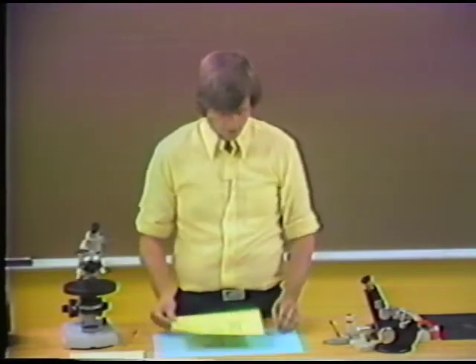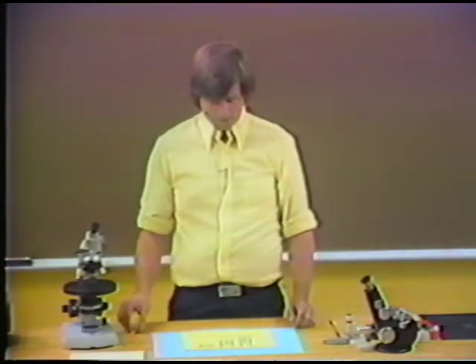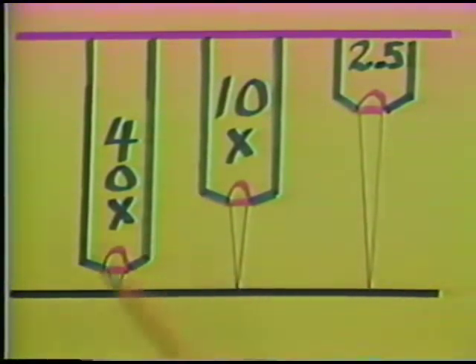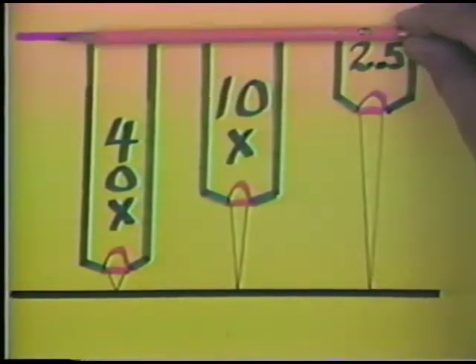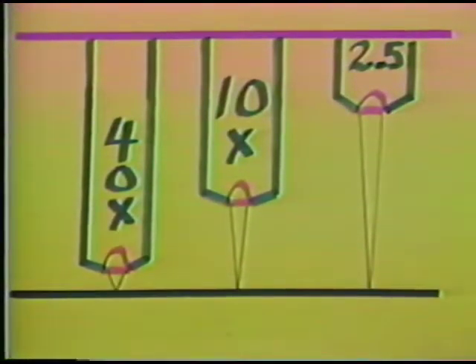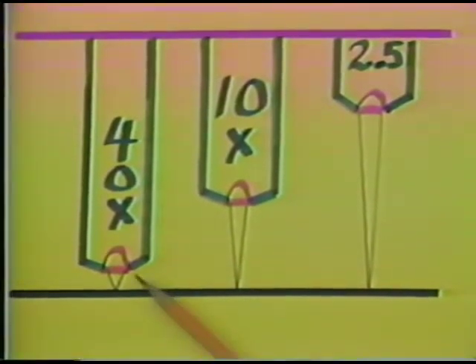Now, this next graphic shows the relationship between the magnification that is typical and the angular aperture and the free working distance. Let me describe this: these objectives are typically balanced, and they come from the turret located here, and the distance between the turret and the stage is usually balanced so that you can rotate your 40x objective in and your 10x objective out, and you don't have to change the distance of your specimen to the turret by a very large factor.